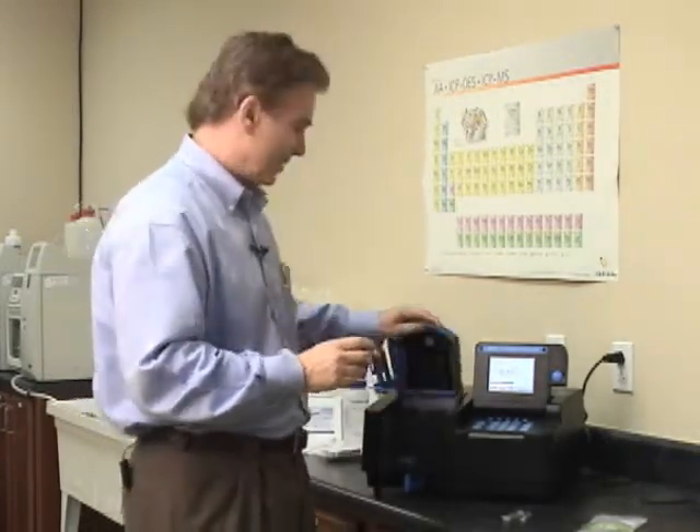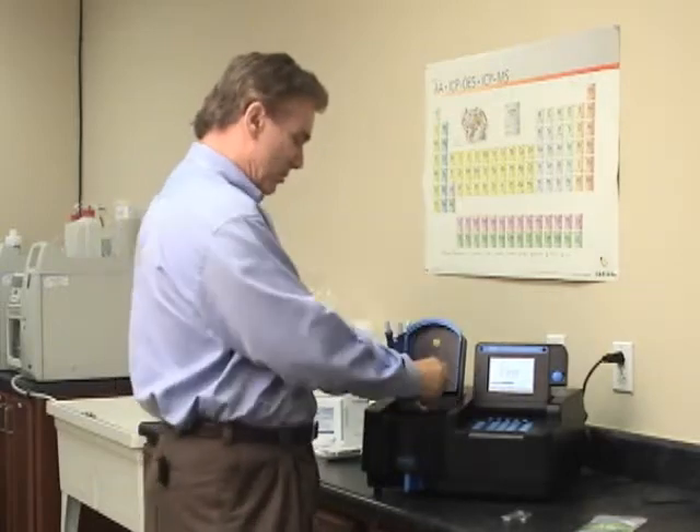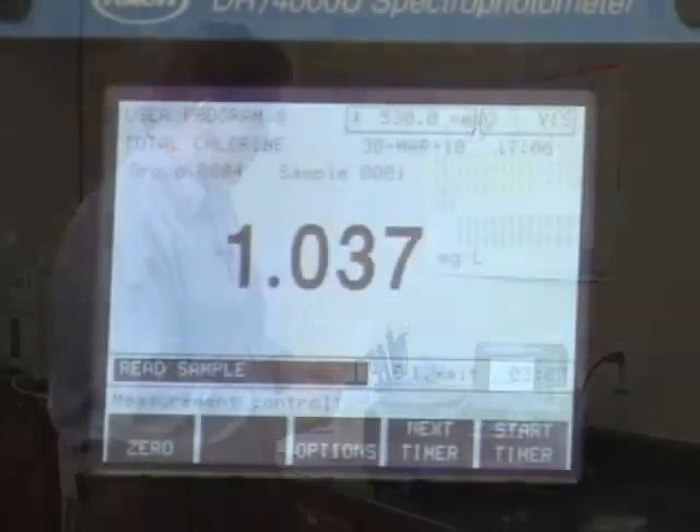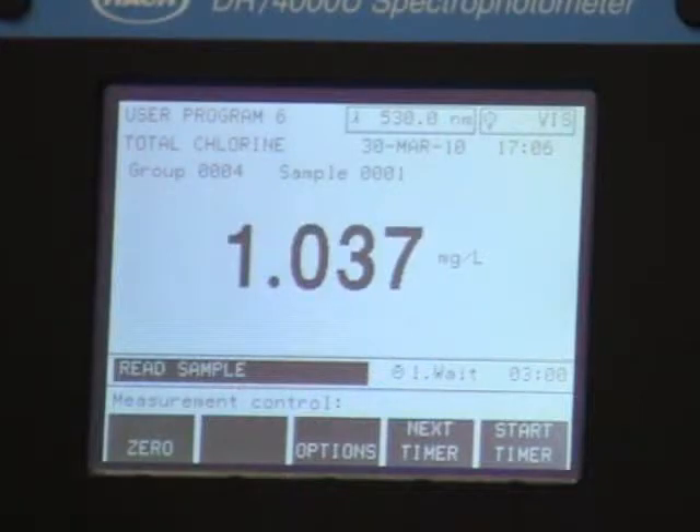That took just a couple of seconds. Put the stopper on, give it a quick shake, and then you allow the color to develop for the method required — I think it's about three minutes. We'll do this a little faster today and not wait. I've already zeroed the instrument. This specific standard was set to give one milligram per liter assigned value once diluted, and you can see here that we're getting 1.037.